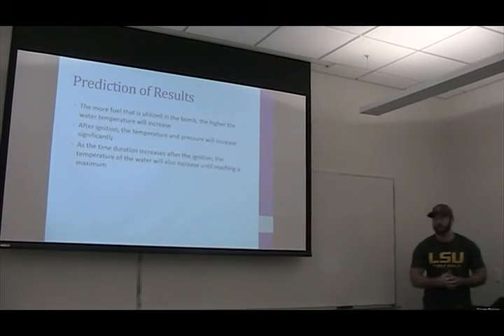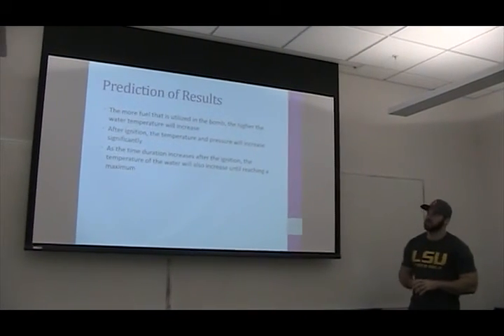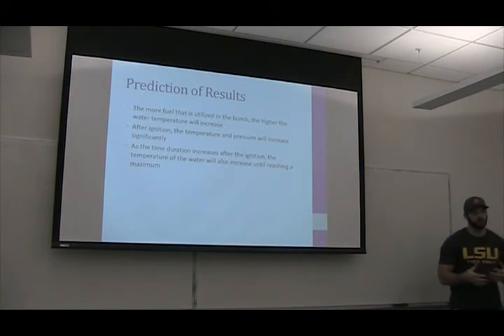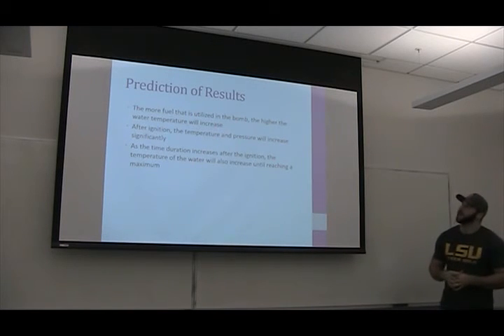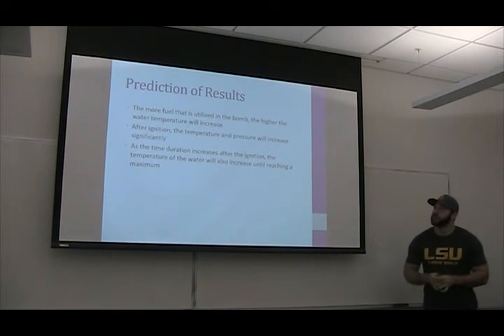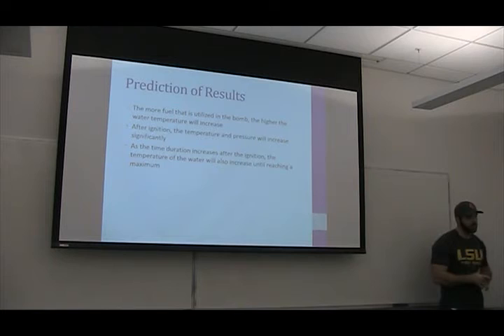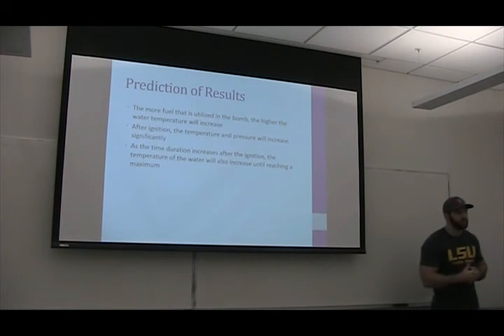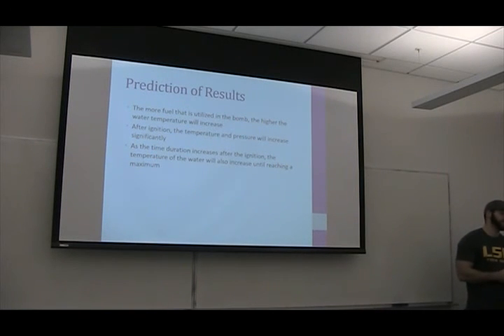So for my prediction of the results, pretty simple. The more fuel you add, the more heat units you're going to get output, the hotter the water is going to be. And after ignition, the pressure and temperature will both increase significantly within the bomb. And as your time duration increases, the temperature of the water will also increase until reaching a maximum.